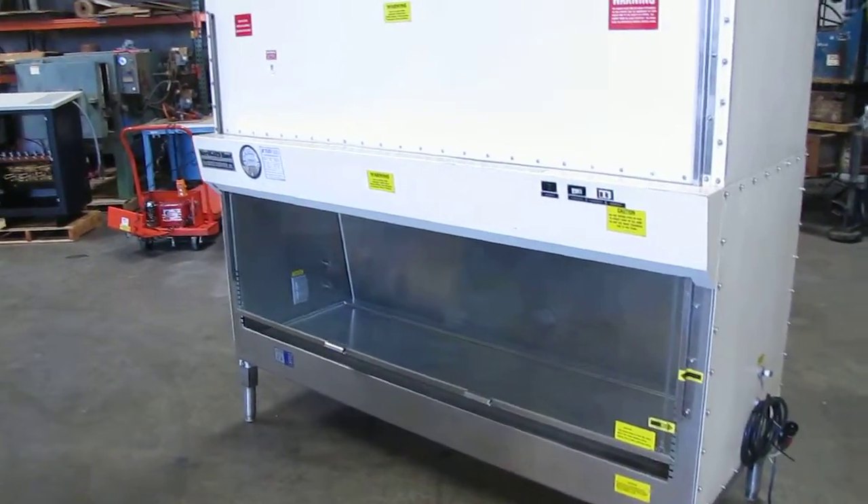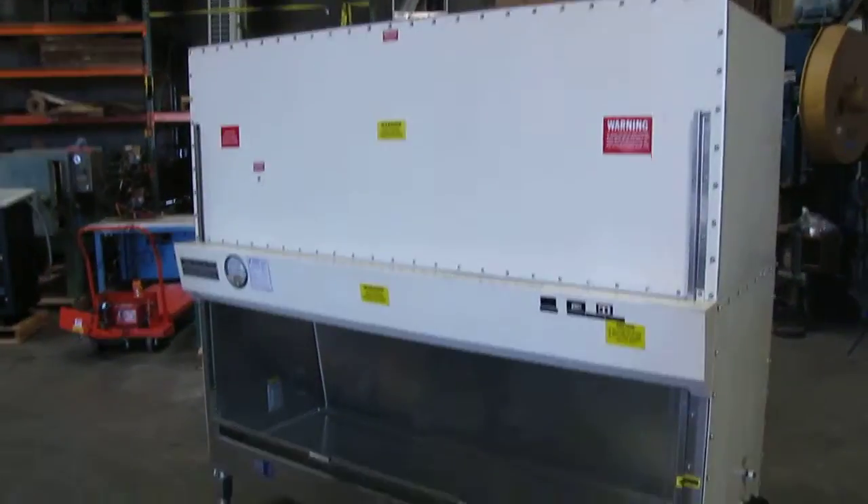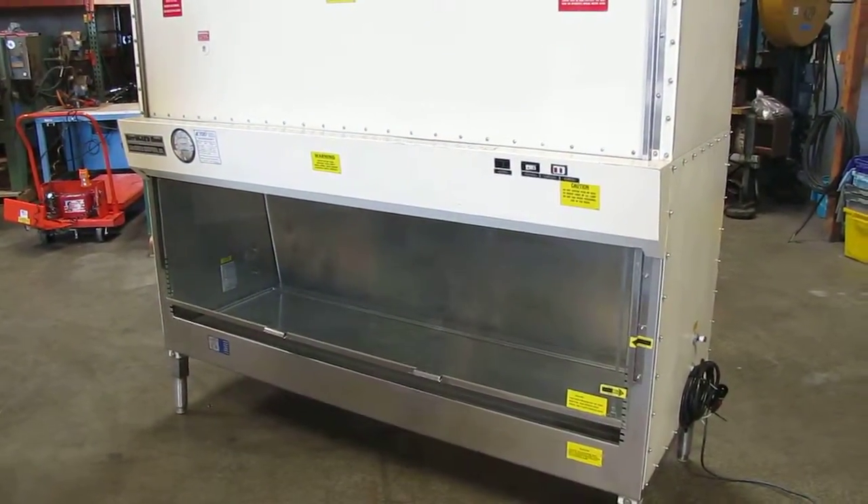Here we have the Baker Co. Steril Guard fume hood. We got it hooked up to 120 volts.